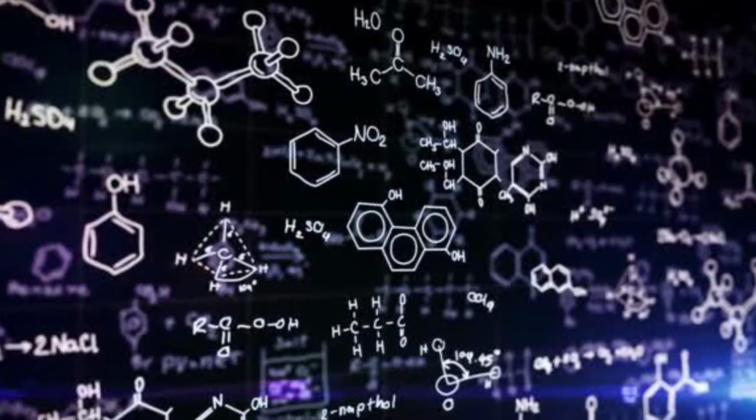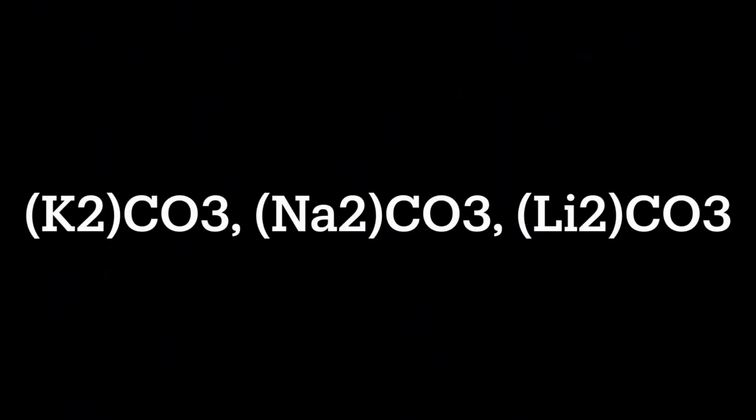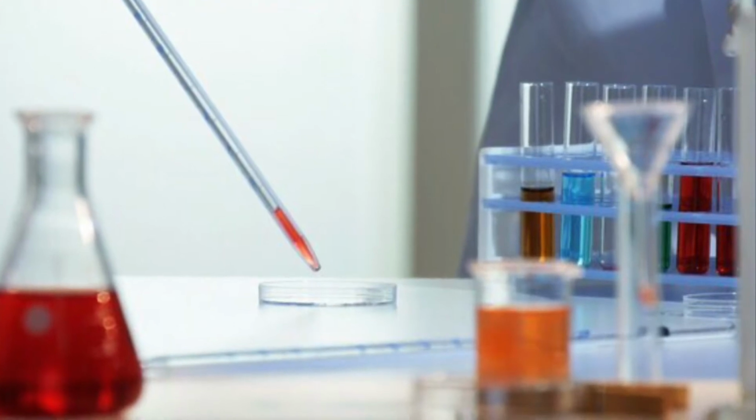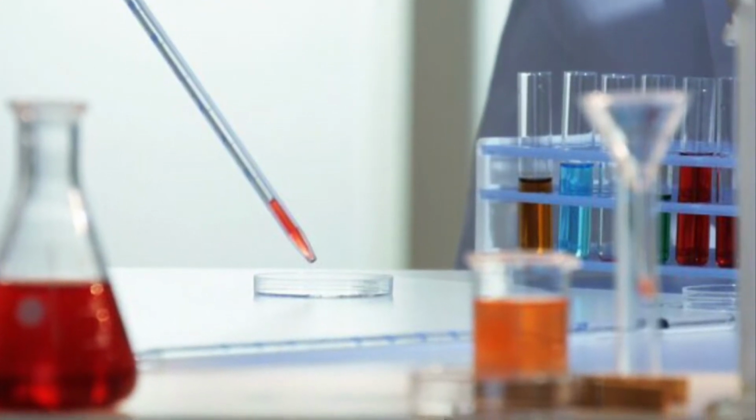I decided to choose these salts because they were the ones that my school had in stock at that moment, and because they were fairly cheap. They happen to be from the same group, which you can see by looking at their molecular formula too. I also chose them so that the results would not be exactly the same. Some salts were harder to dissolve and some were easier.